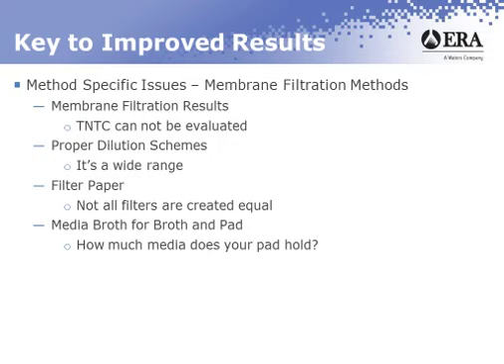You can do that by just measuring how much is in the ampules to begin with, pour it onto the filter. If you have broth that doesn't get absorbed in the filter, measure how much of that, some people call it pour off, still exists. If it puts you outside of that tolerance, it's possible that those pads have become compressed over time or have absorbed moisture. If that happens, you're going to make it difficult for you to get a good recovery because you're not delivering the amount of nutrients to the organism that really is going to be ideal for growth.